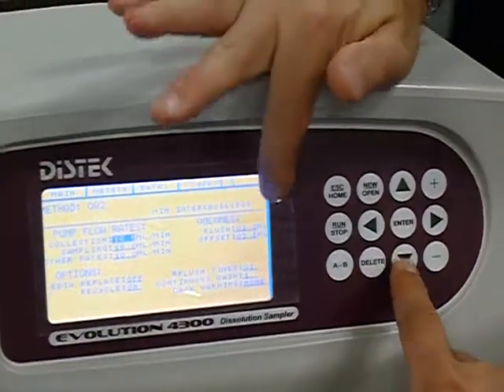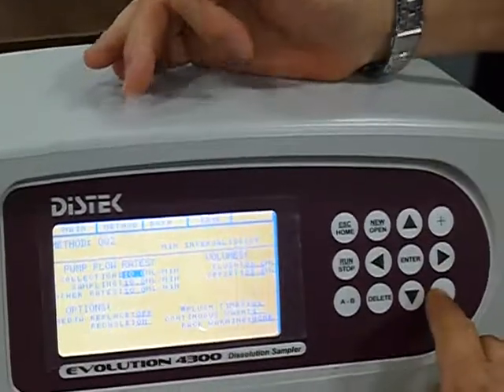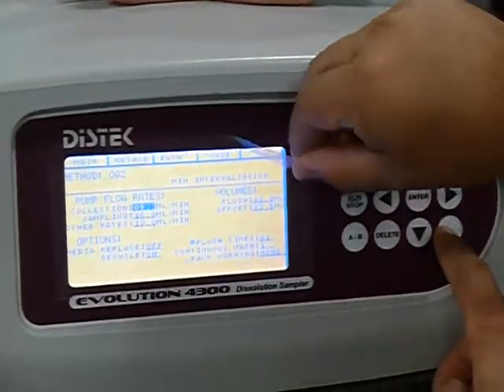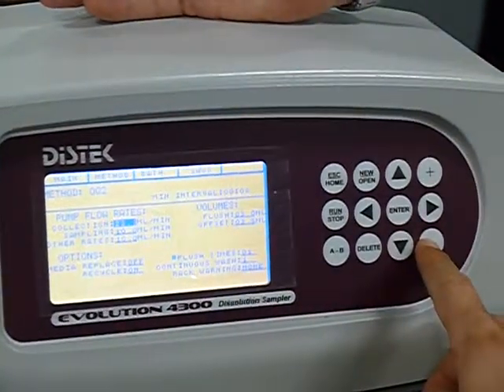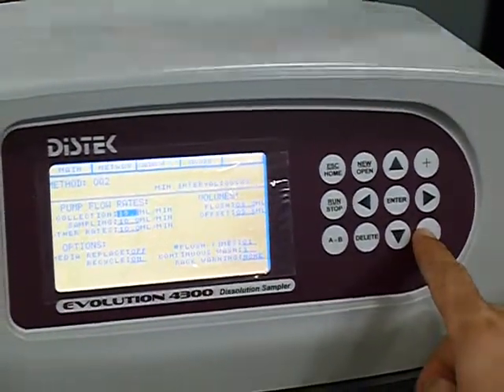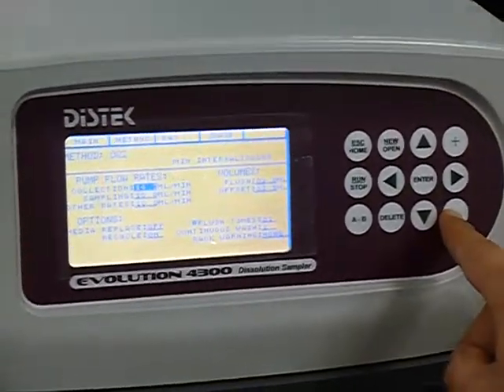And seeing that 3 and 3.5 over there, that offset volumes. Action. You can see the reflex. Oh, yeah, that's why if you want to get more in front. But you see this offset and volumes over here, they're already at 3 and 3.5.